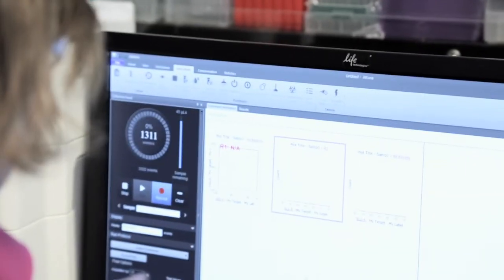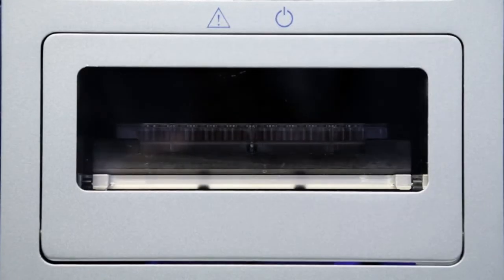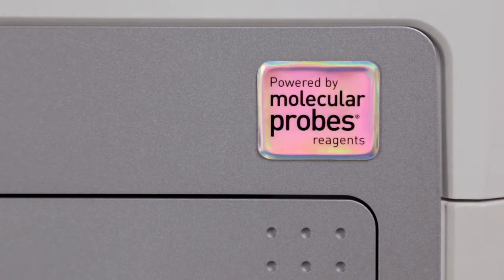The guides can be a great asset in teaching others how to do flow. The beginner often uses few applications and a few reagents. As they grow with experience and expertise, they use a greater range of applications and more colors.